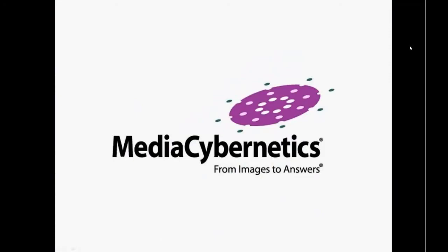Media Cybernetics has been at the forefront of innovation for over 30 years. And today we bring you the latest iteration of our flagship product, Image-Pro. You may have heard of this product in the past by many names such as Image-Pro Plus, Analyzer, Express, or Insight. And today we talk to you about our latest Image-Pro Premier software, which is the upgrade version for all of these products.